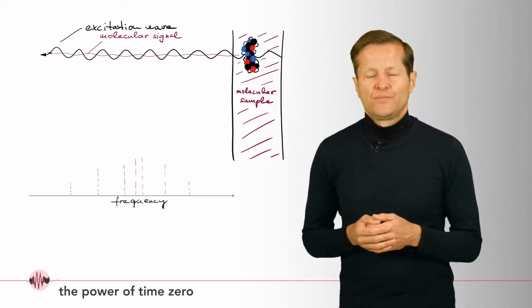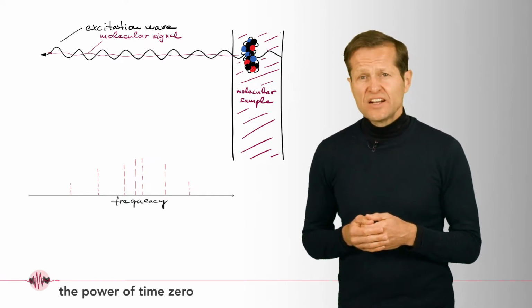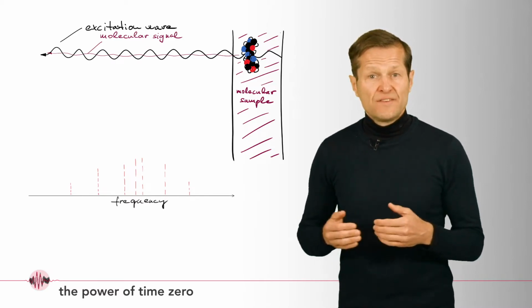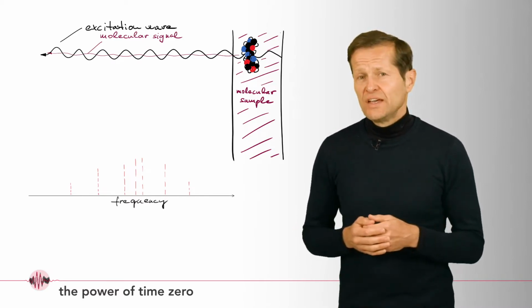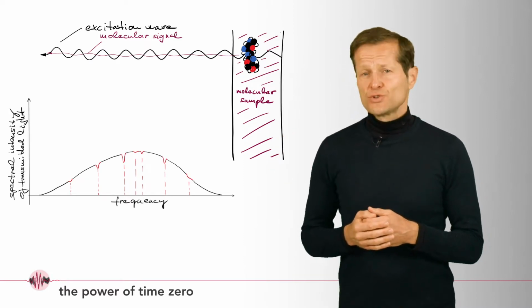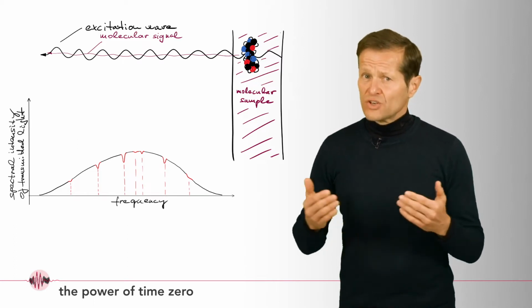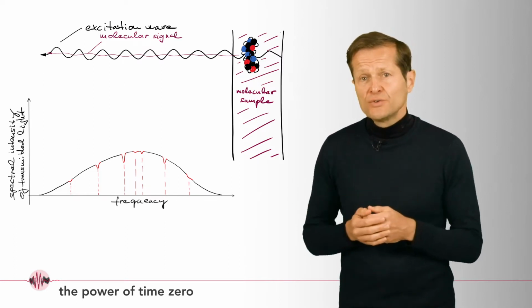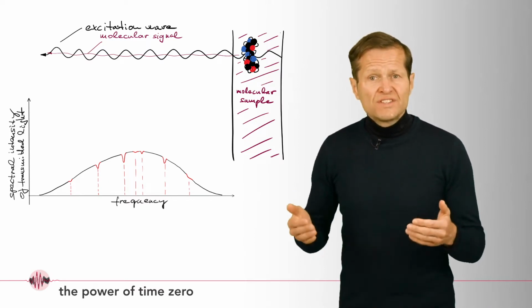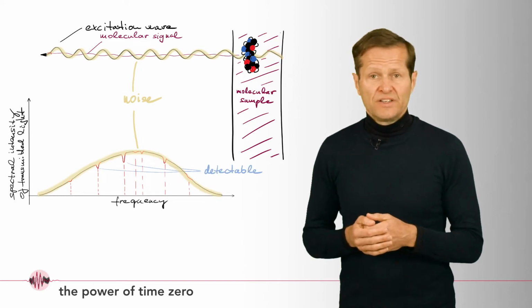of the sample. The signal oscillates out of phase with the incoming wave, reducing its spectral amplitude at the vibrational frequencies and creating absorption dips in the spectral distribution of the transmitted infrared light. The smaller the concentration of the vibrating molecules, the smaller the dip. The smallest detectable dip is limited by the noise carried by the excitation.